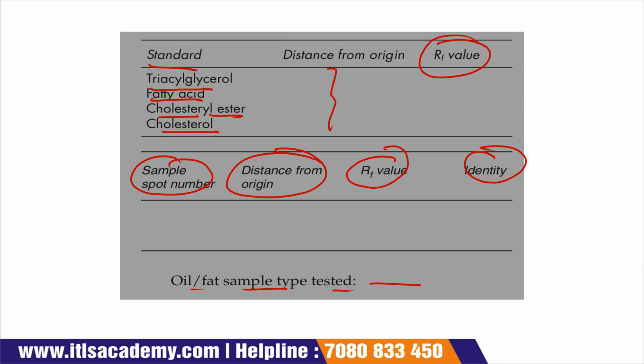So this is all about the determination of lipid with the help of TLC, that is thin layer chromatography. I hope you will understand.